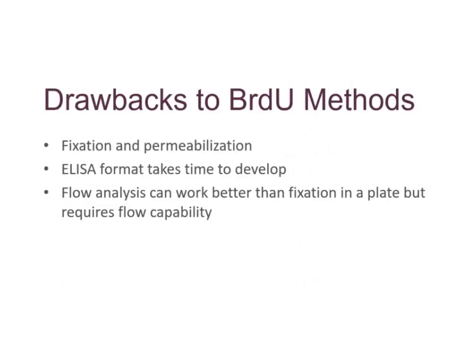There are some drawbacks to this method. I mean, it gets you away from the radioactivity, but you do need to fix and permeabilize the cells. And this can be a problem, particularly in the plate-based assay. What we've found is that it can take time. You need to really monitor that fixation and make sure it's complete.